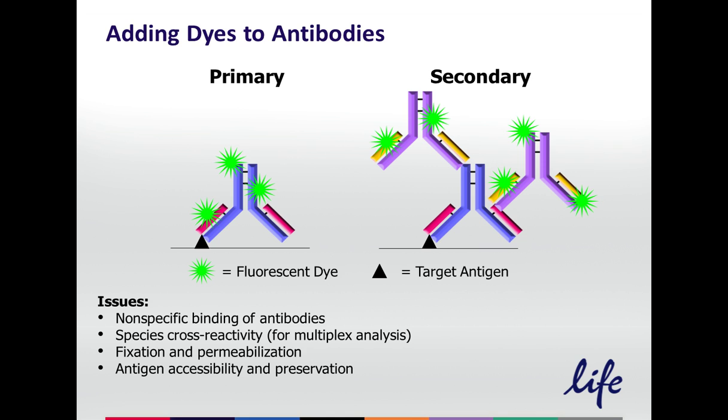Another one, if you have too little of the dye, you wind up with a conjugate that's too dim. If you add too much, you can sometimes have dye-dye quenching, where the dyes actually quench each other if they're too close and too crowded. Or you change the hydrophobicity and charge on your reagent, causing your protein to drop out of solution, precipitate, often irreversibly. So caution has to be taken when doing conjugations of this nature. I should add here that the next webinar in this series will be for our antibody conjugation kits. So be sure to check in for that.